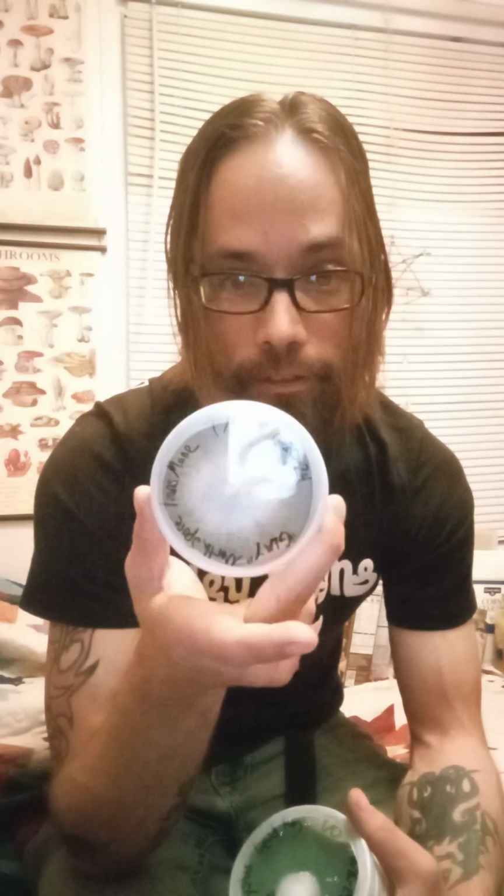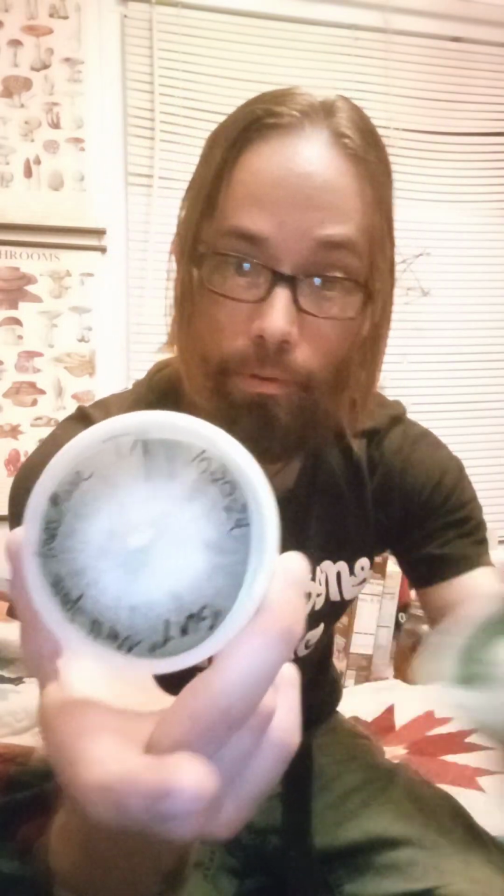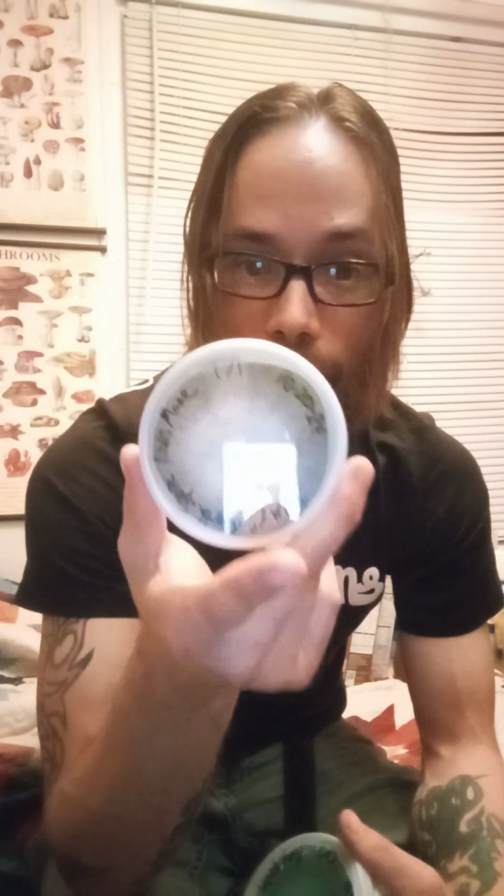When I rotate through to other media, because this is a T1 off of my long-term storage. That piece there is from long-term storage. I'll probably make a master grain bag with a quarter of this plate, and then I'll make 3 other plates, take 3 small transfers, and then I'll just put this up. It'll be ready to do the same thing over again.